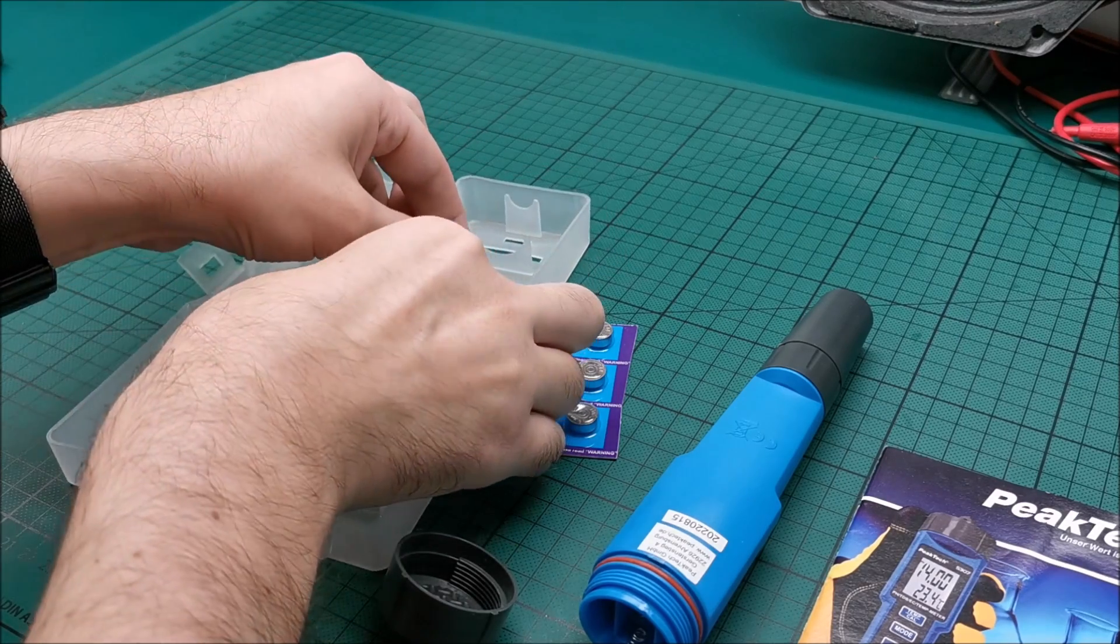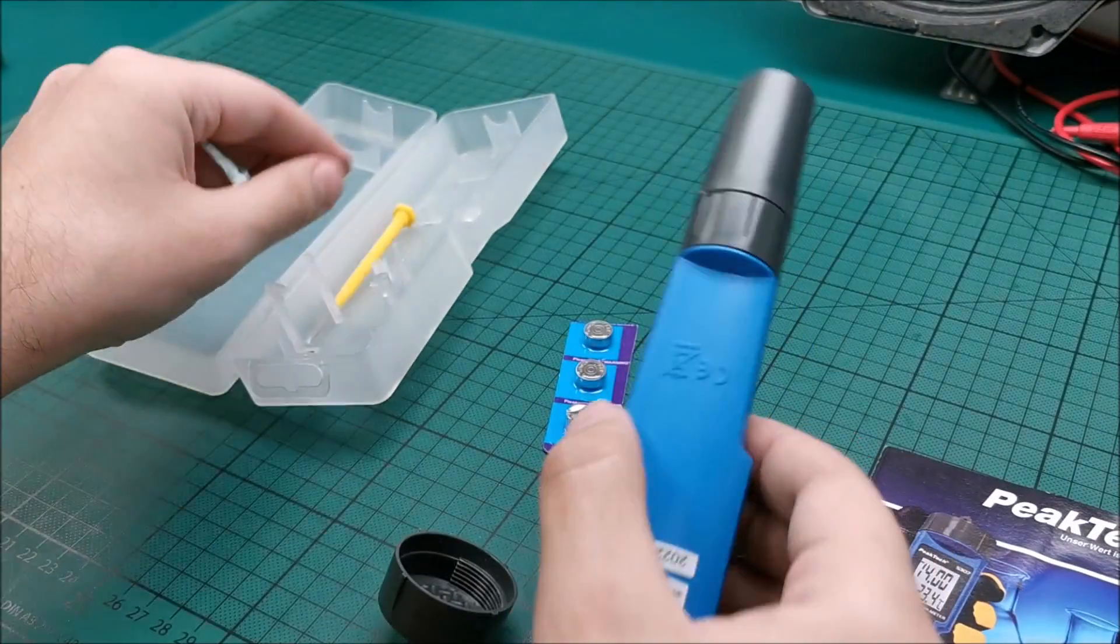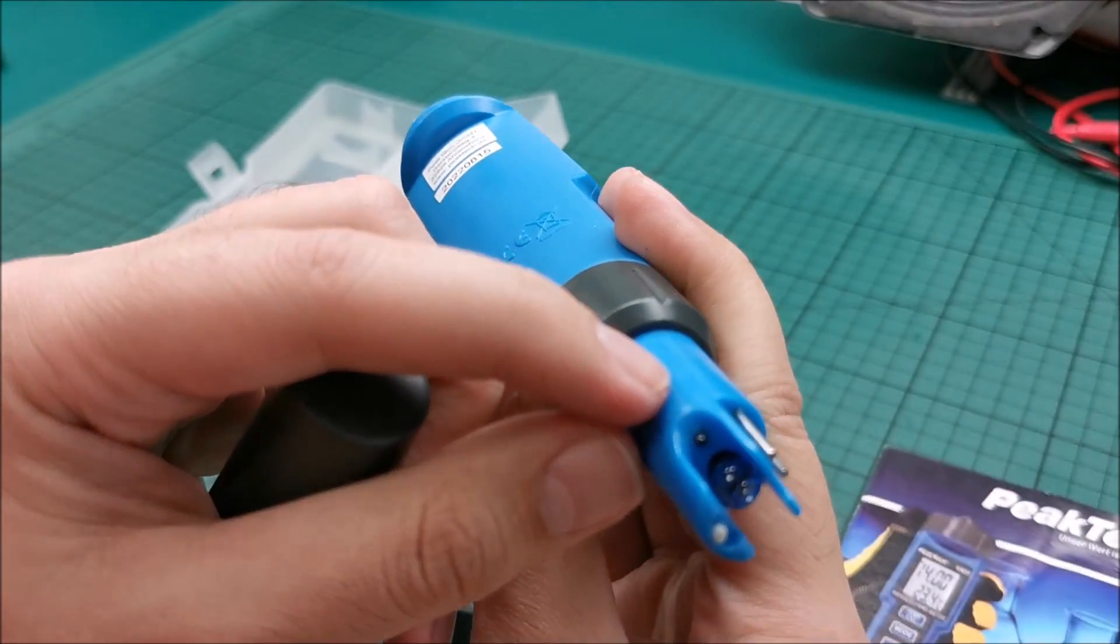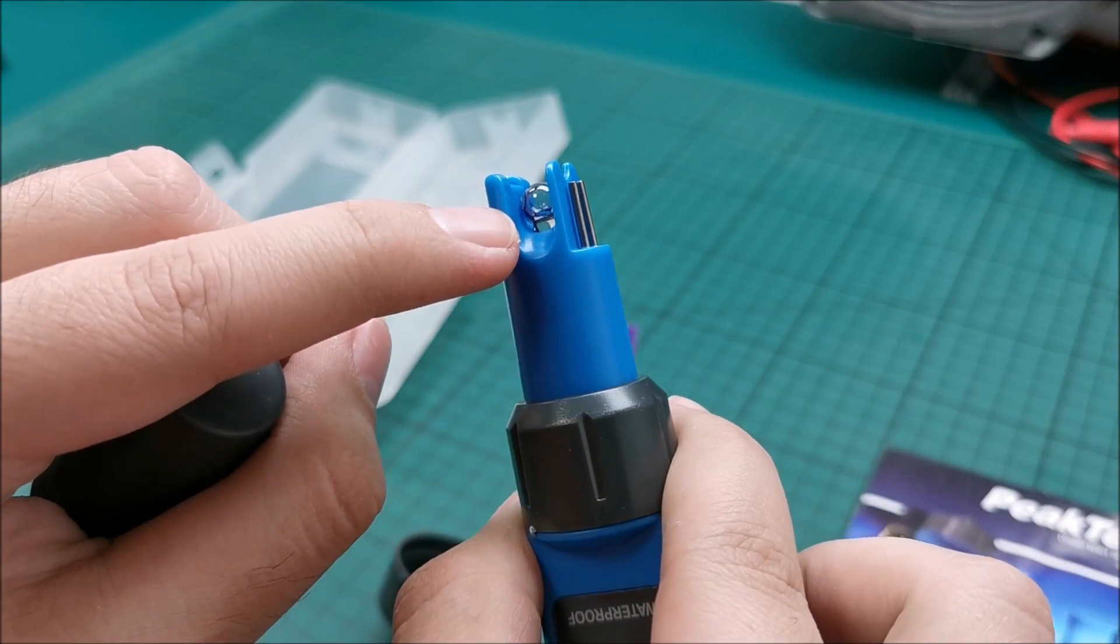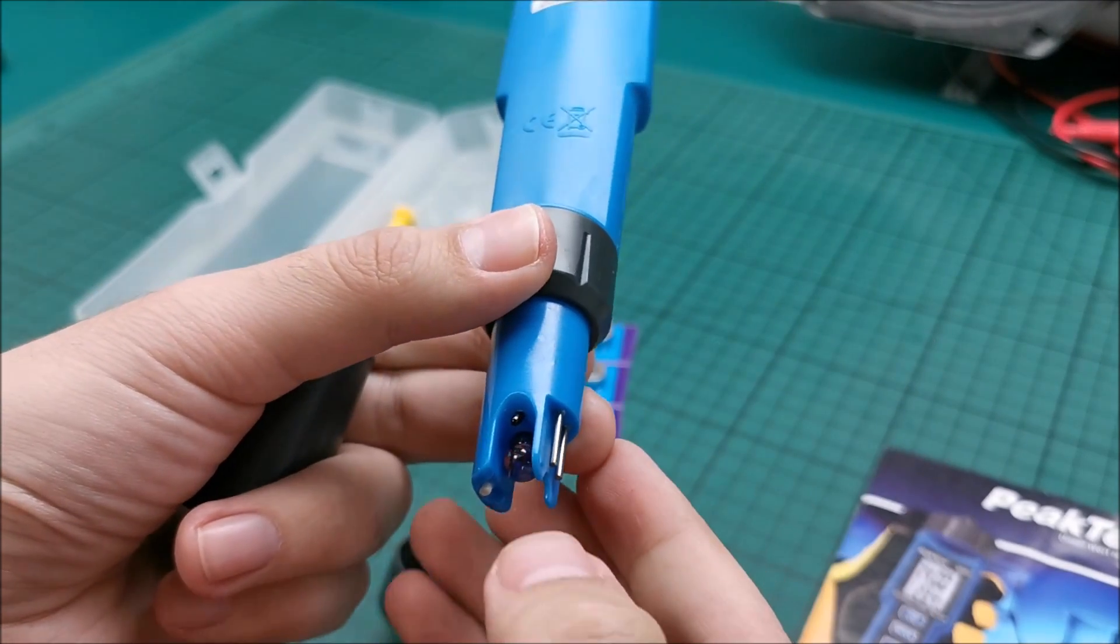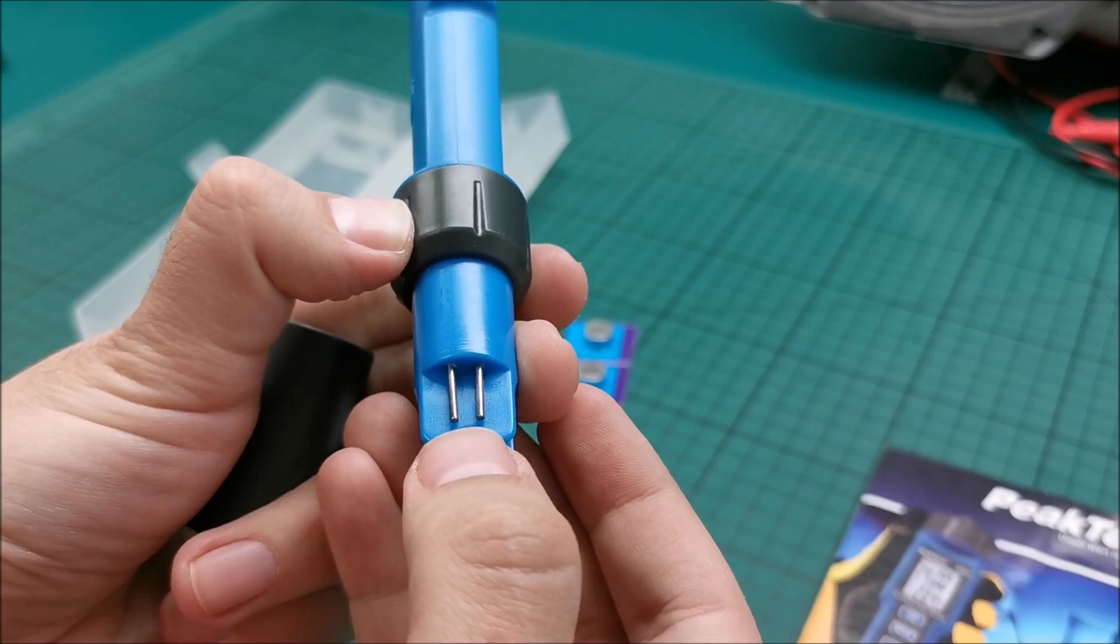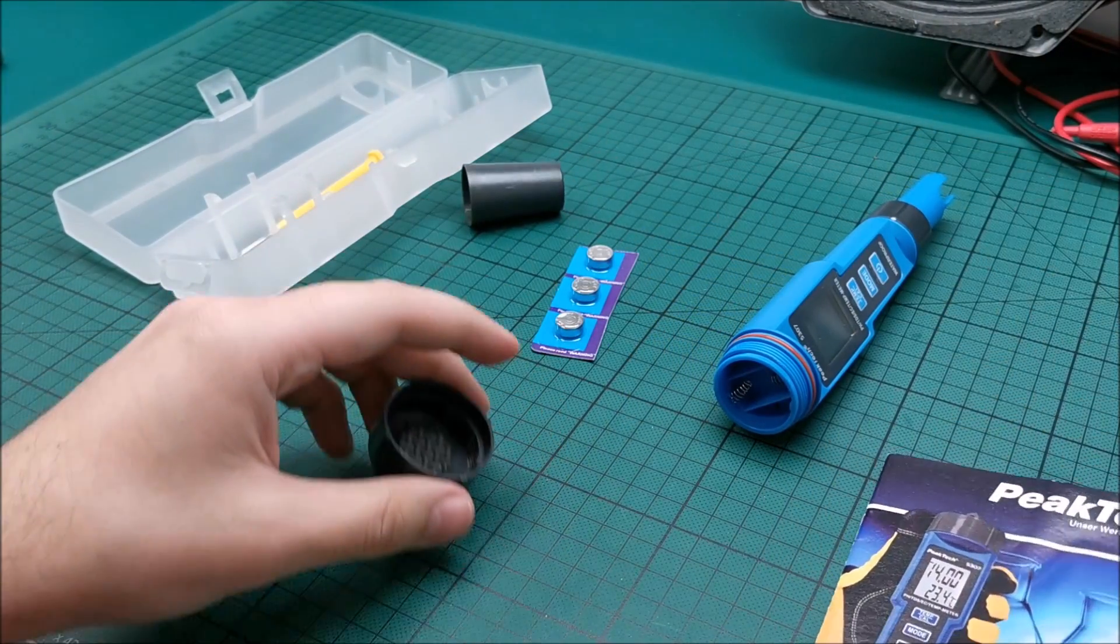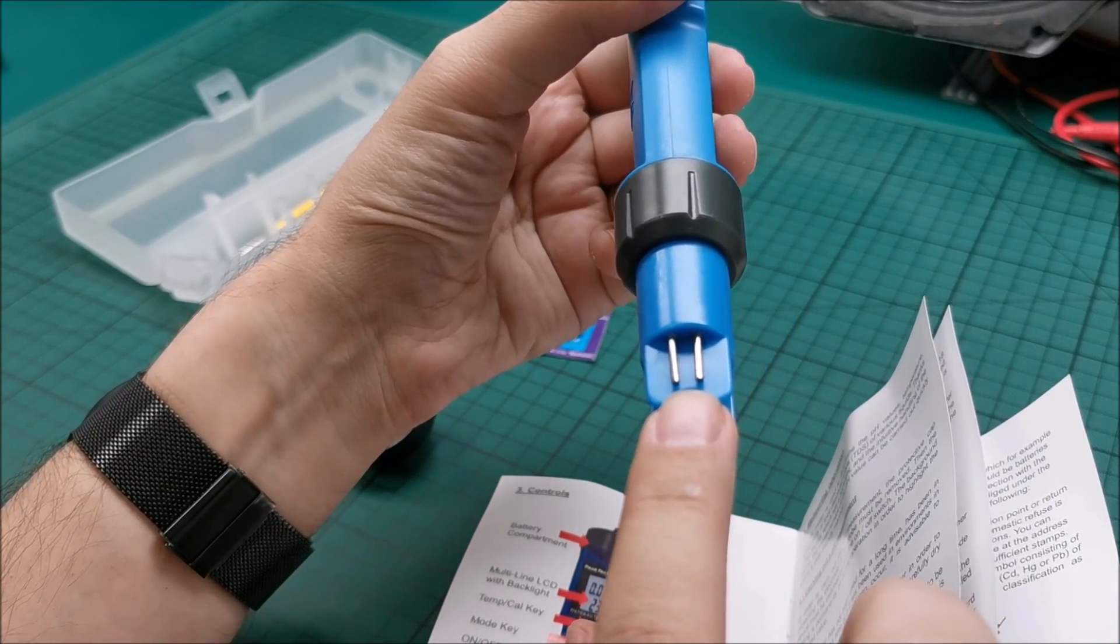What I'm not 100% sure yet is why we have a small flat head screwdriver in the package. Maybe it will make sense at a point. So I'm guessing that what's actually checking the pH is the glass tube in there. The black one might be the temperature sensor. And these two, let's see the manual.